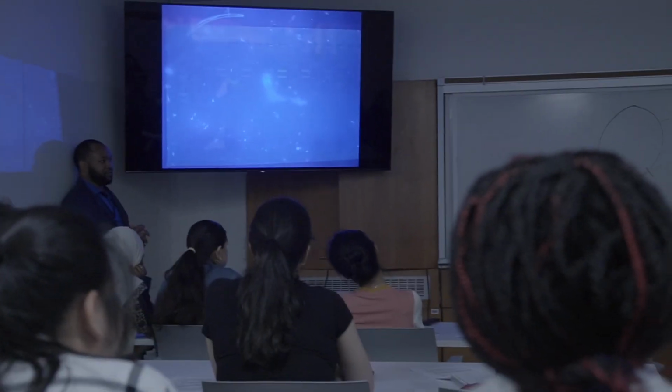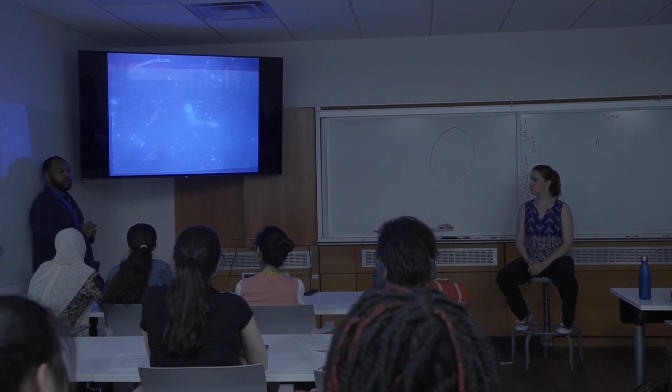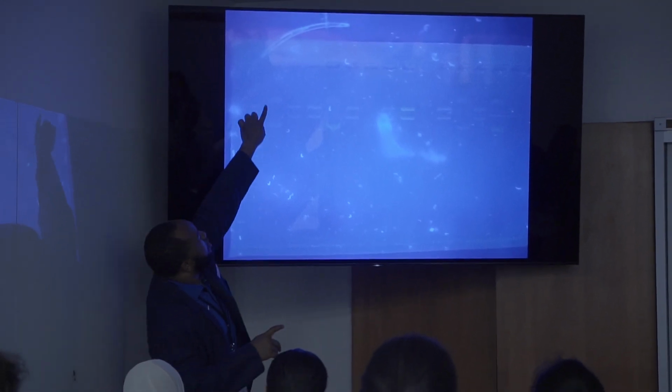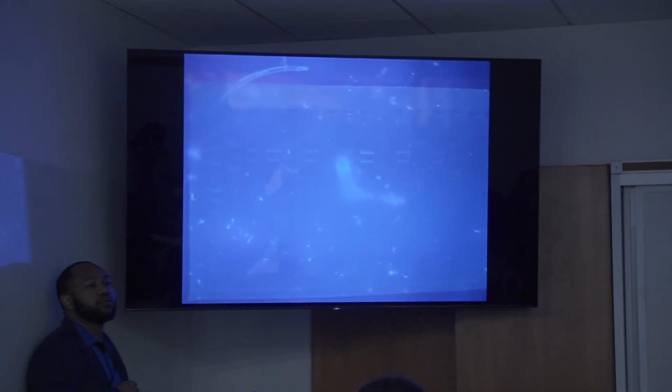So what do you think that is? What do you guys think? Do you think there's 2 bands there? Because we only expect 1, right? Because we were amplifying 1 piece of DNA. So let's start here. Which band do you think we should have, right? If there's 2, we know we should have 1. Which of them should we have and why?